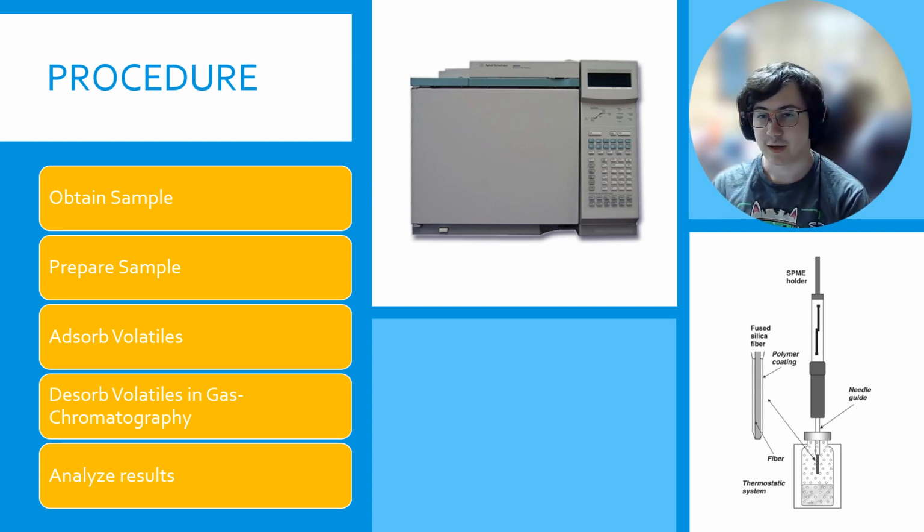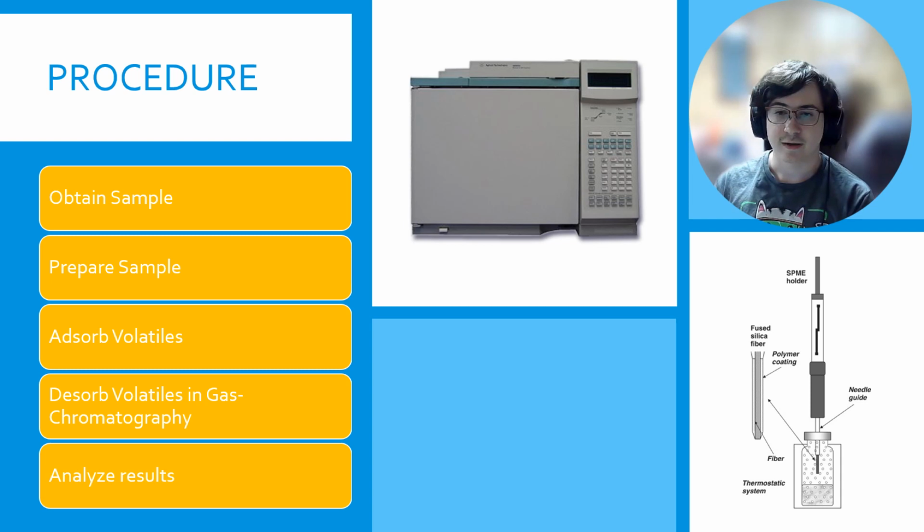For me, I put a known amount of 3-octanol into water, sometimes beta-ionone, and then I would sample that, relate it to a peak area, and try to get consistent peak areas. If this happens reliably and we get reliable data, that can let us move forward with the project, because we'd be able to tie concentrations to compounds present in dog urine.